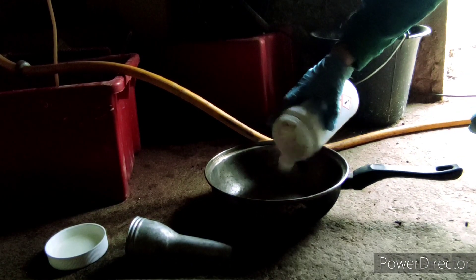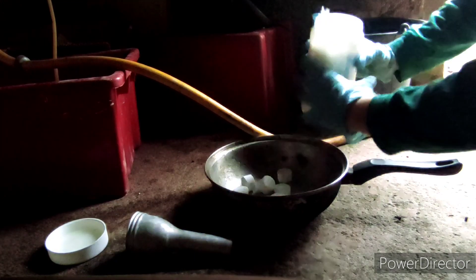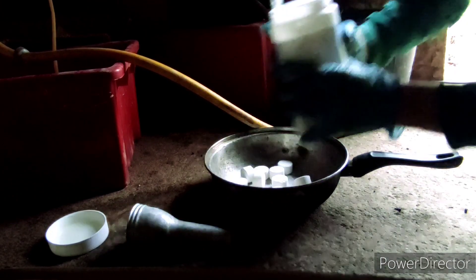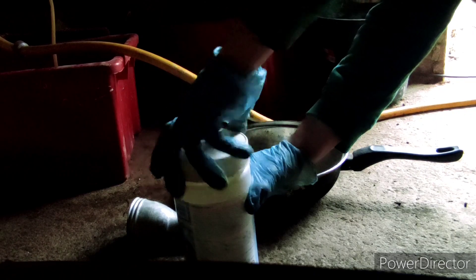We start by grinding up the BCDMH into a fine powder as much as we can. Here is a timelapse of me doing it. Please don't reproduce what you see at home — bromine is a dangerous and corrosive liquid. The vapors are very toxic and produce acid in contact with water. You are made of 70% water. Funny, nah?